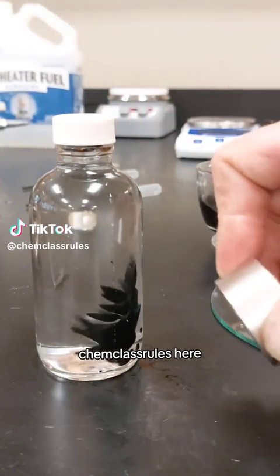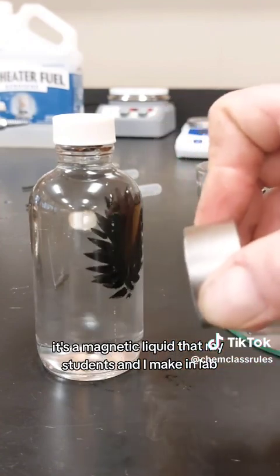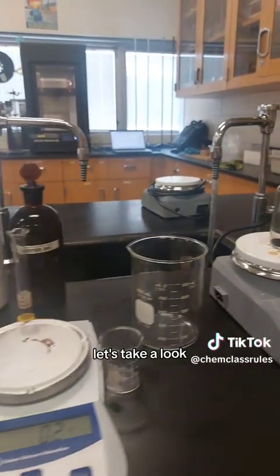Hey everybody, Chem Class Rules here. This is ferrofluid. It's a magnetic liquid that my students and I make in lab. Want to see how we do it? Let's take a look.